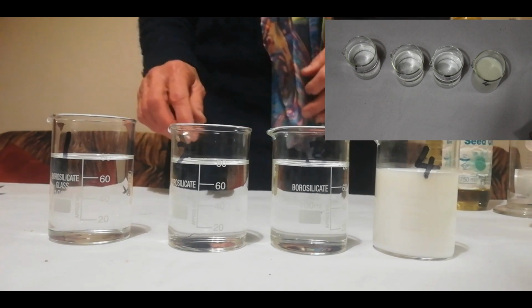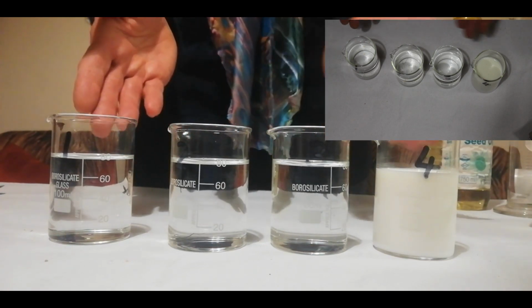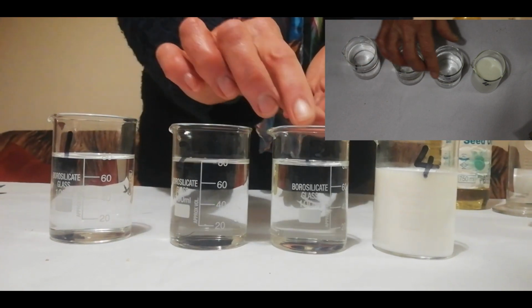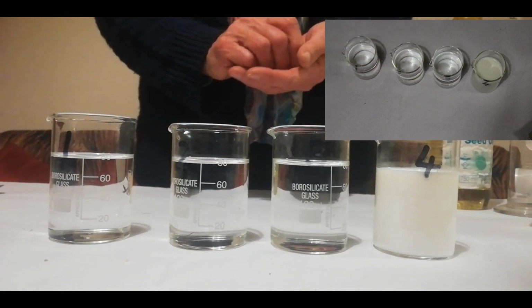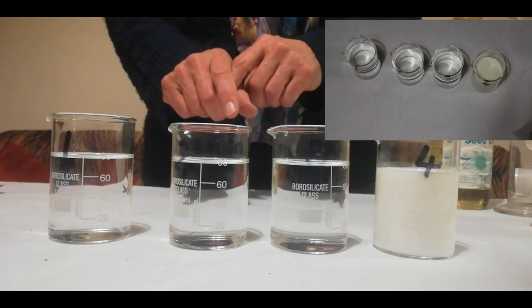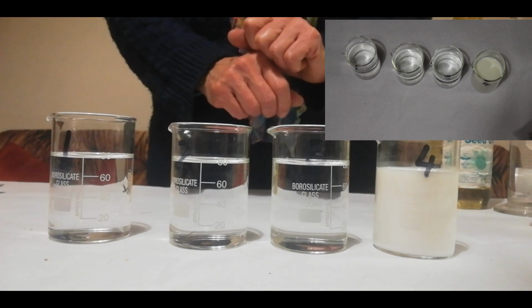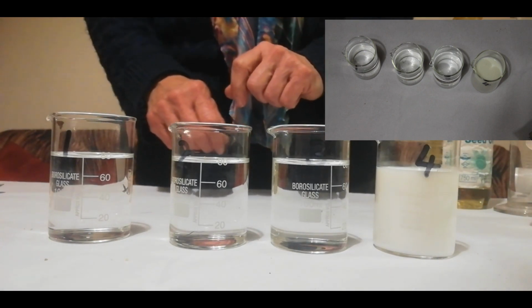Now we're going to do some different ones, and this is activity 3 in your textbooks. So get your book ready. I have asked you that you draw the tables, so make sure you've got your tables drawn before you proceed. Okay, so what have we got here to test liquids with solids? I just have 80 milliliters of water. I know your textbook says 100, but my beakers were a little bit small. So they've all got 80 milliliters of liquid. The last one has milk and the others have water.